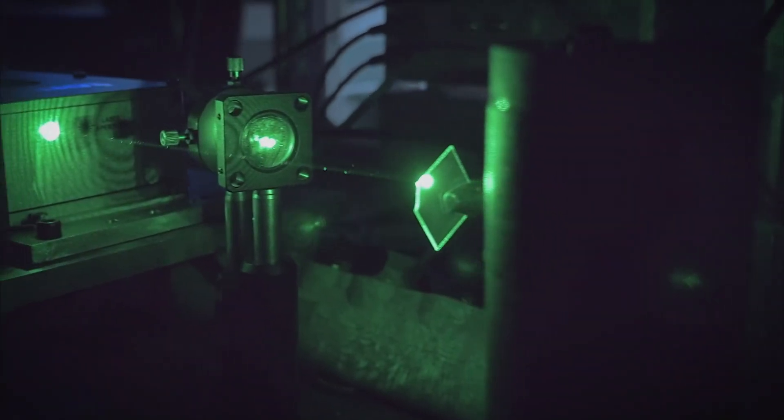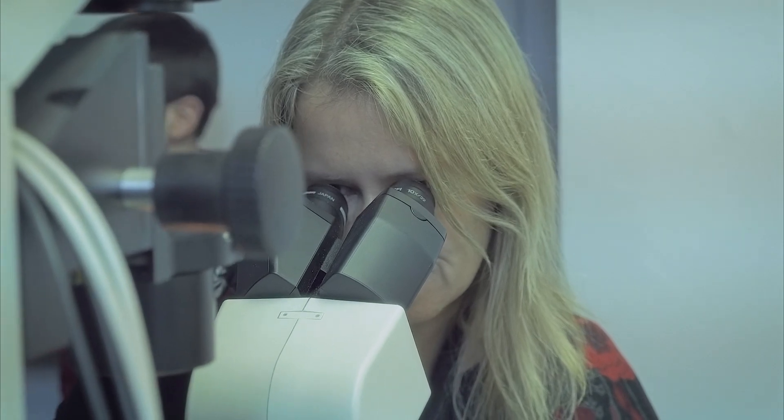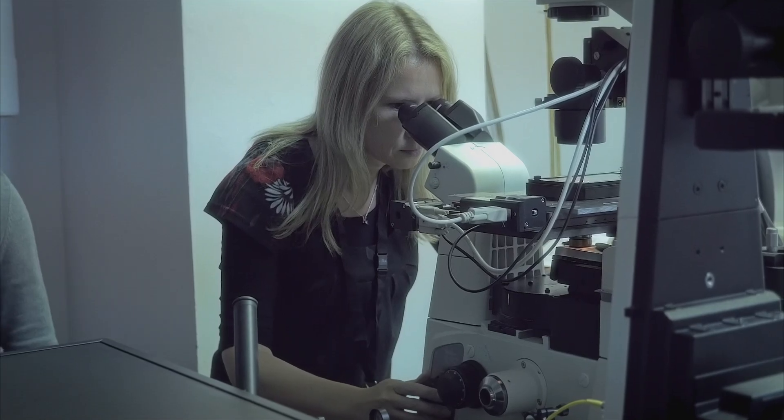Thanks to recent improvements in laser instrumentation, physicists have created a new type of non-invasive microscopy technique to image live cells and tissues.